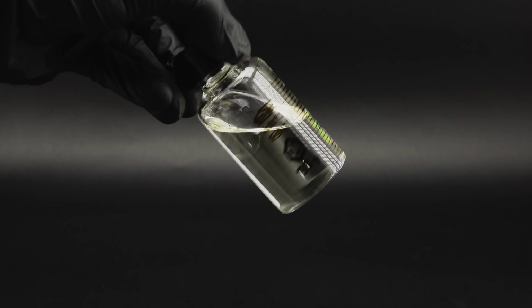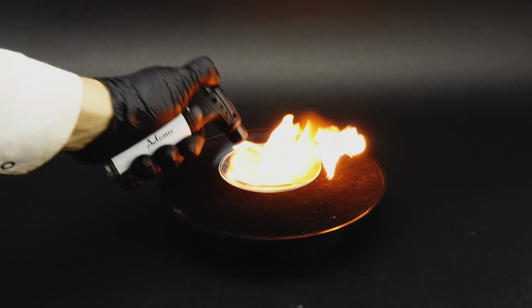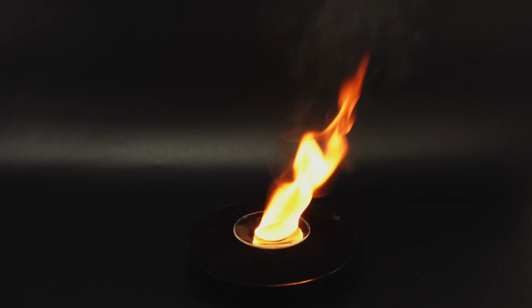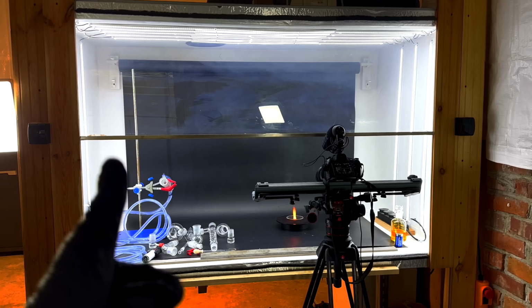For the first one, I wanted to do a burn test, since being an unsaturated hydrocarbon, benzene should have quite a unique flame to it. Indeed, upon lighting a small amount of it on fire, it burned surprisingly brightly and produced a stupendous amount of this black soot, which nicely coated the inside of my fume hood and will probably remind me of this project for a long time.